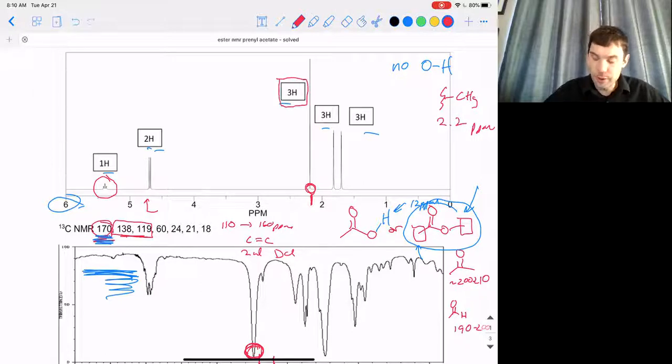And so remember, your generic old methyl group sticking off of anywhere that is just hydrocarbons tends to be at about 0.9 ppm. Those that are next to carbonyls, or those that are bound to an arene, appear in this 2.2 region. And so the good news is we don't have a benzene ring in here, so odds are good then that it's going to be next to that carbonyl.